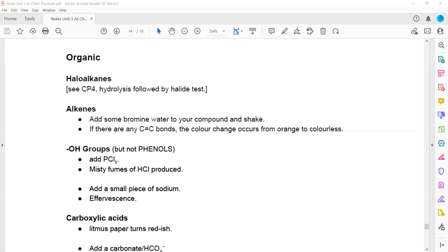To test for the presence of an alkene, we add bromine water and shake. If a double bond is present, a color change will occur — the solution changes from orange to colorless.